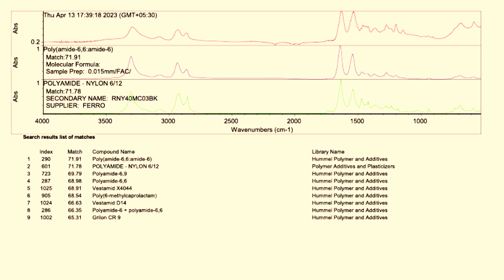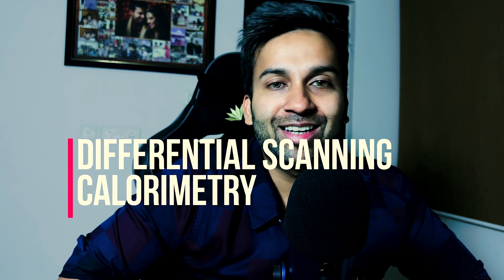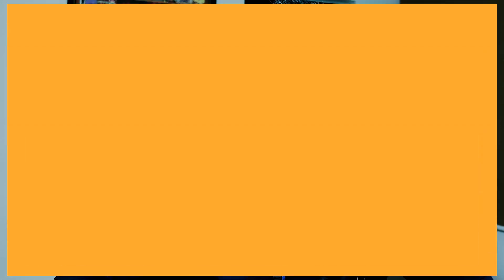When matching with the library, it only shows a 71% match with nylon 6-6, because we do not have nylon 4-6 in our library. That is why you always need to understand a little bit about the wavenumbers and where you find the peaks. And you can always double-check the precise type of nylon using the DSC technique through the melting point.